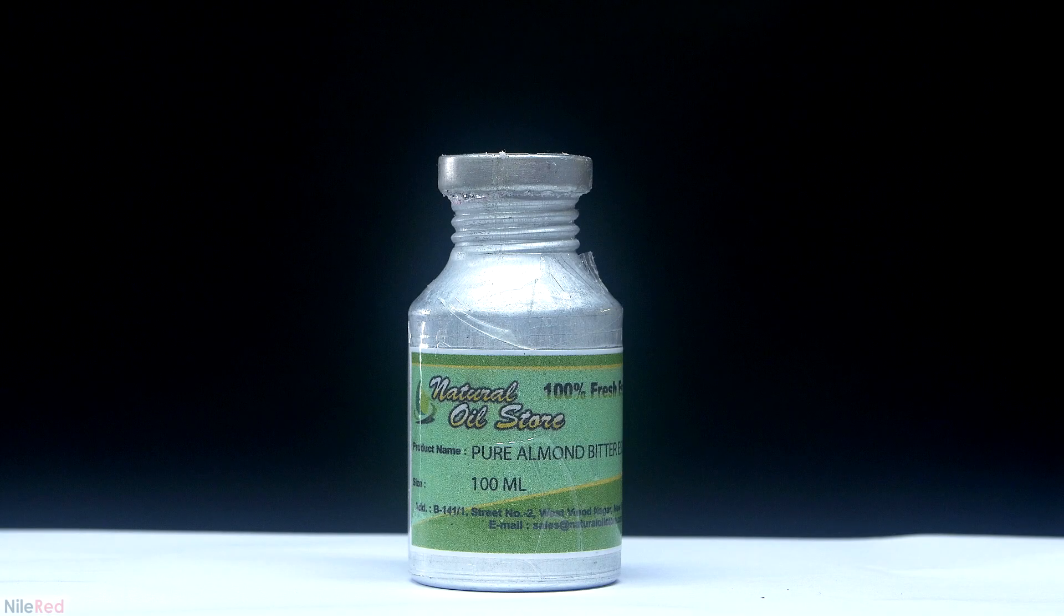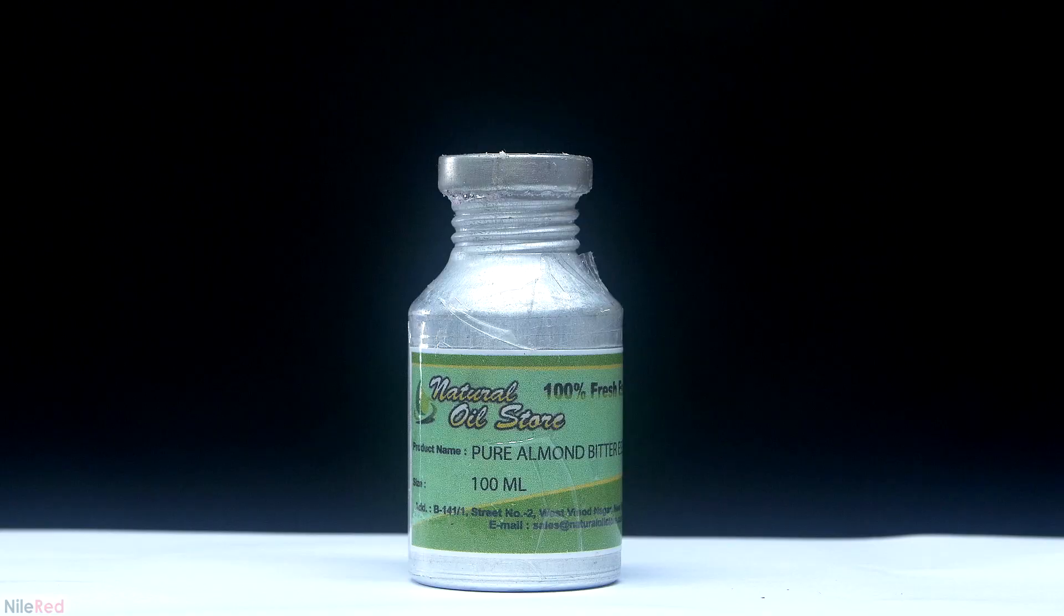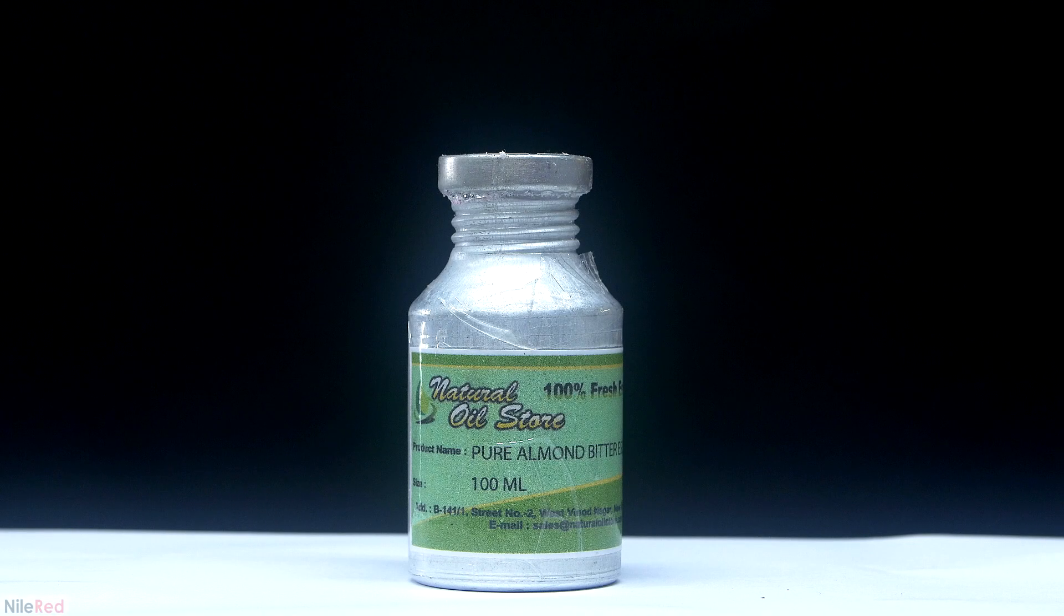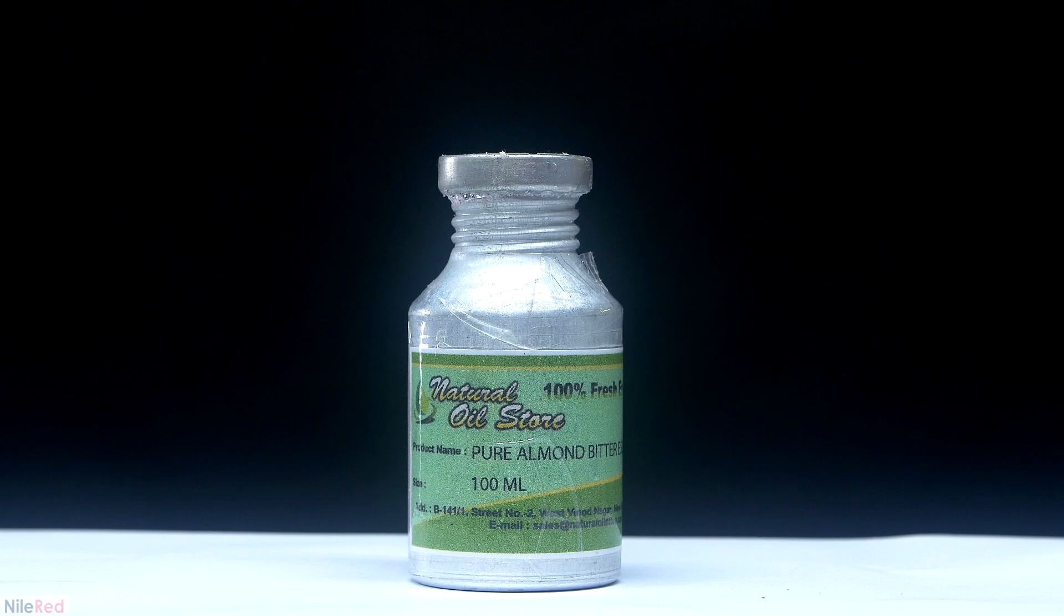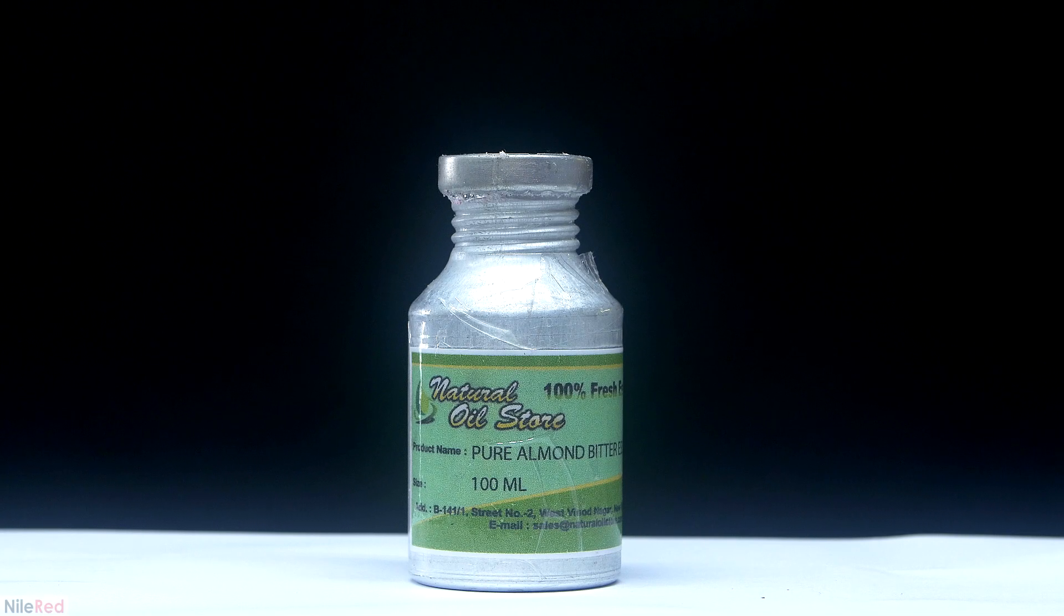Here I have some bitter almond oil that I got from eBay for about $40. Although the bottle does contain 100 milliliters, I'm only going to be using 70 for this video. I got it from eBay because this was the easiest source for me, but it doesn't really matter where you get it from. You just want it to be as pure as possible.